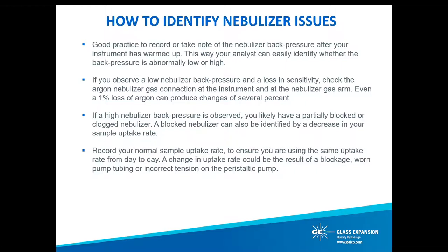In addition to monitoring nebulizer back pressure, your laboratory can also record your normal sample uptake rate to ensure you're using the same uptake rate from day to day. A blocked nebulizer can also be identified by noting a decrease in your sample uptake rate. One very common suggestion: replace your peristaltic pump tubing on a daily basis. Stopping or rerunning analysis due to worn or dirty pump tubing is not a worthy expense, and can be easily eliminated if pump tubing is replaced daily — at least the sample and/or internal standard pump tubing, as those are critical for nebulizer performance.